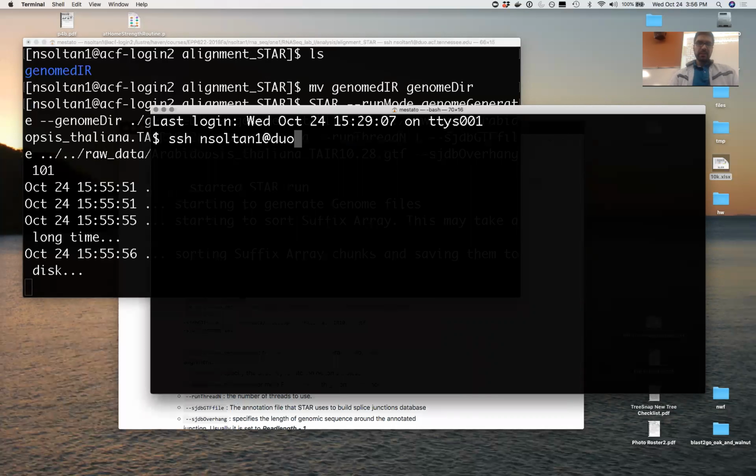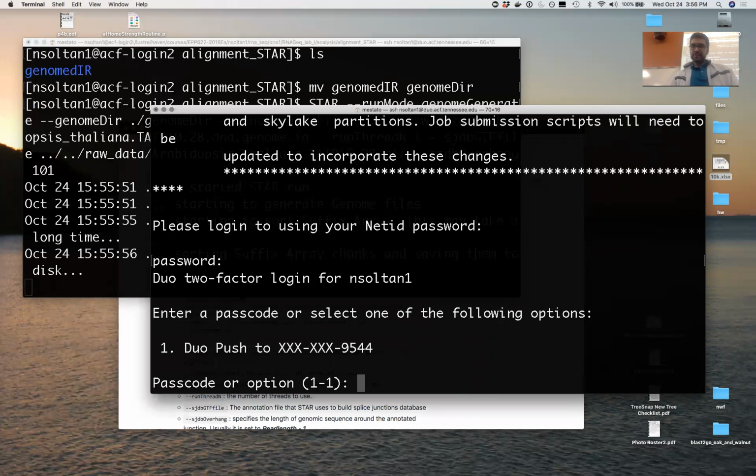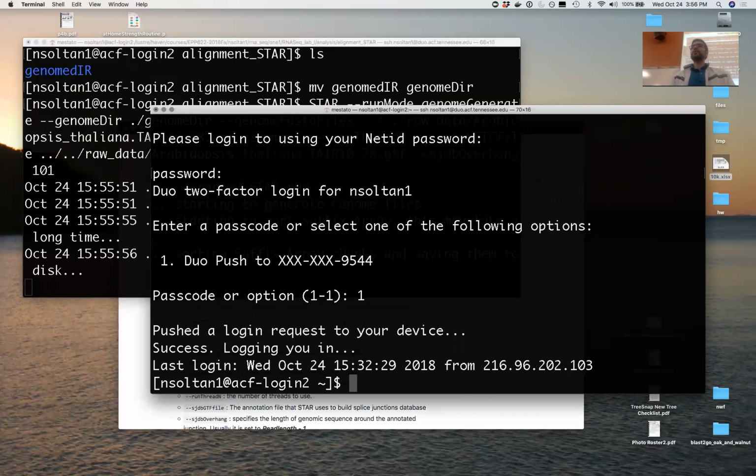Just going to show you how to identify the read length, how to get it. Now I can feel how slow logging in is now. It takes 10 seconds. That's probably us. It's a bit weird, but okay.